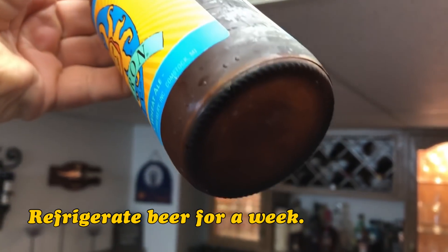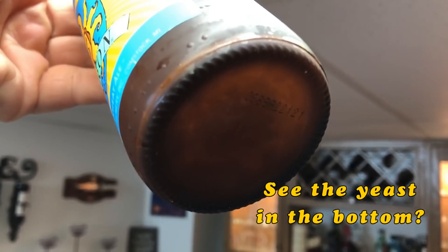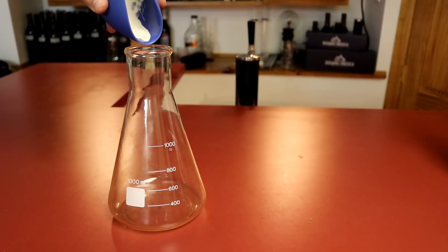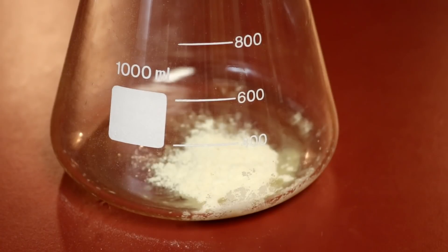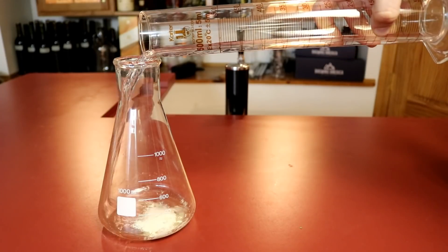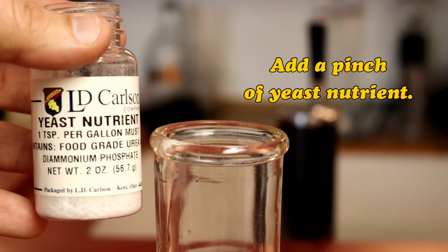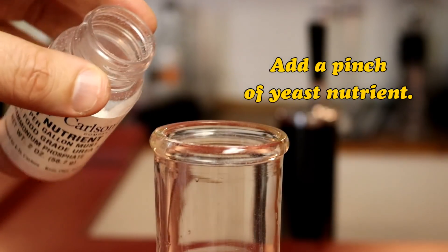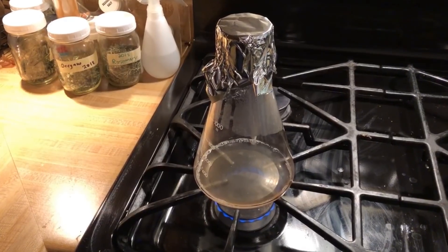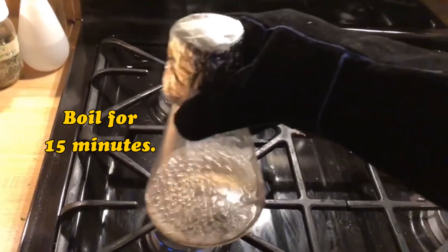Refrigerate your beer upright in a cold fridge for up to a week to precipitate the yeast to the bottom of the bottle. Weigh out four grams of dry malt extract and add it to the Erlenmeyer flask. Measure out 75 milliliters of chlorine-free water and add it to the flask. I also like to add a little yeast nutrient to my yeast starters. Then I clip a bit of foil on top, put it on top of the stove, and bring it to a boil. I let it boil for 15 minutes.